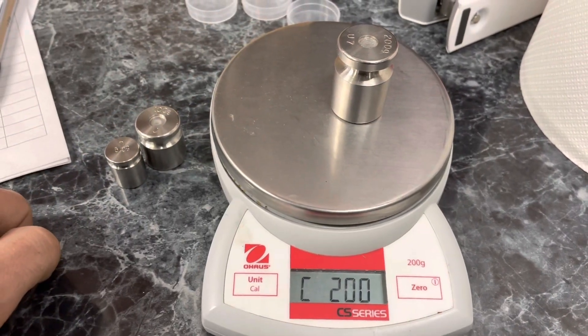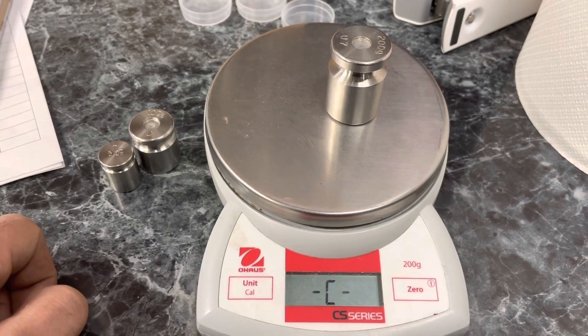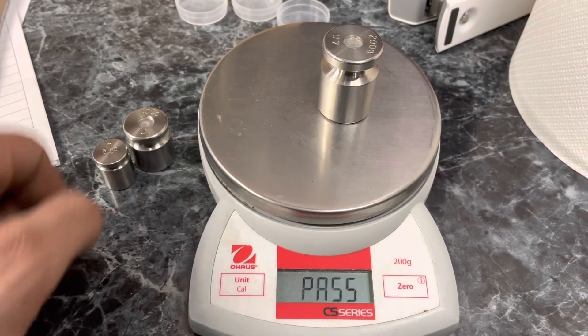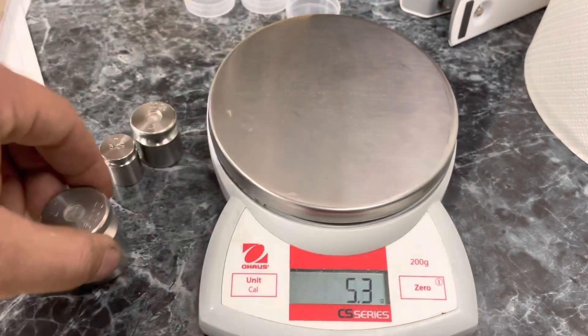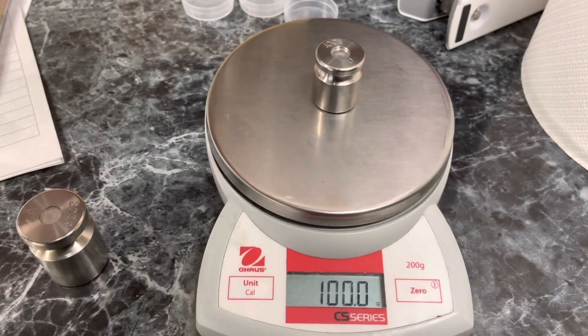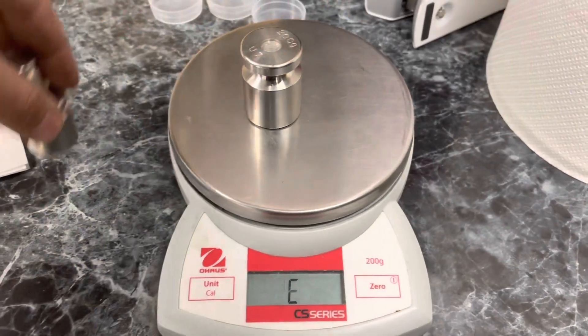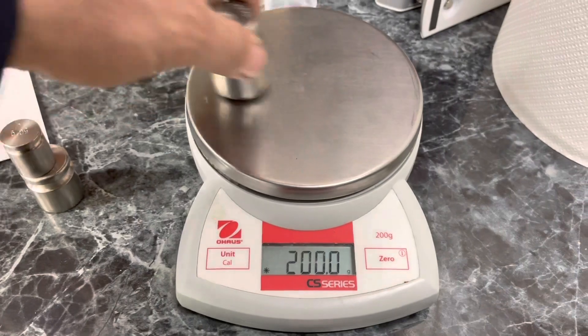Then it'll prompt you for the weight you would like, which is 200 grams. We hit our accept button, it calibrates, and now our scale is perfectly calibrated, as you can see here as we go to test the scale. If you have any questions about this, please leave them down below and I'll catch you all in the next one. Thank you.